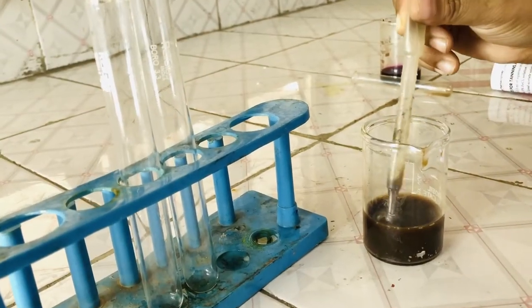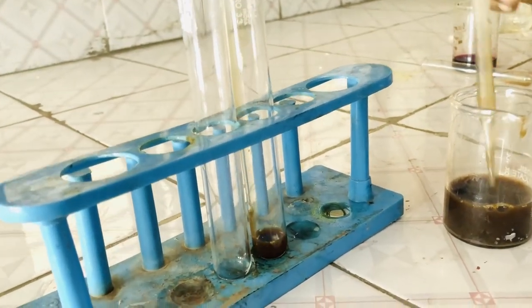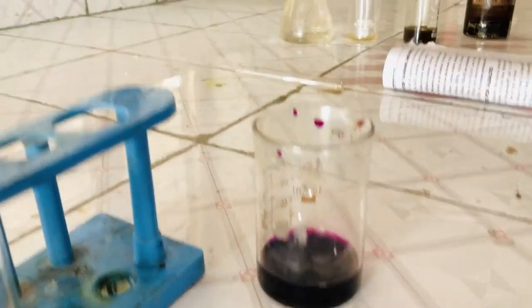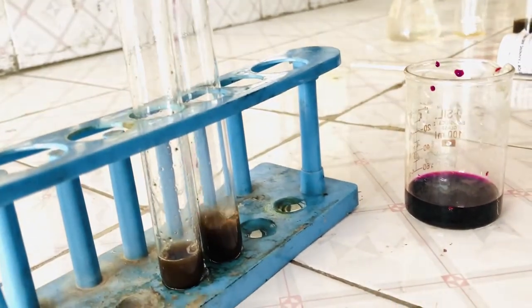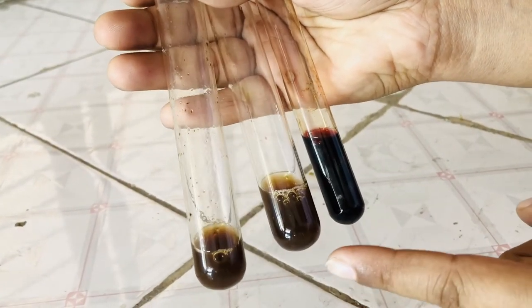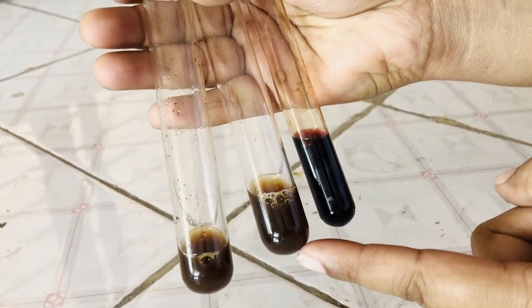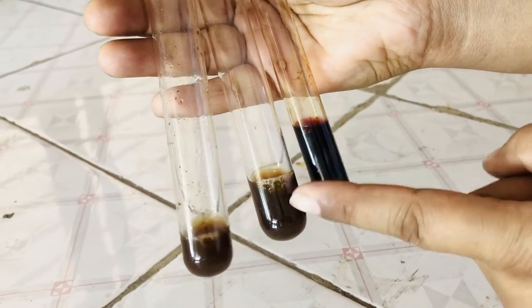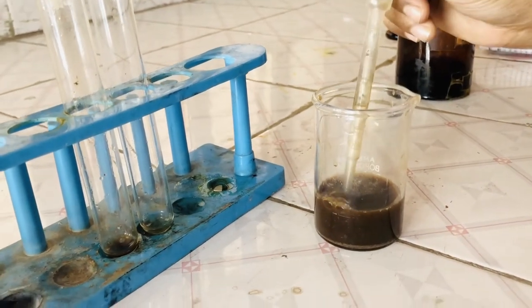Now again we will prepare the test and standard solution of the amla. Now we will add KMnO4 to the test solution. This is the standard solution. Test solution in which we have added KMnO4 and this is the standard KMnO4 solution. You can see the decolorization of KMnO4 solution has taken place in the test solution. This confirms the KMnO4 test for tannins.